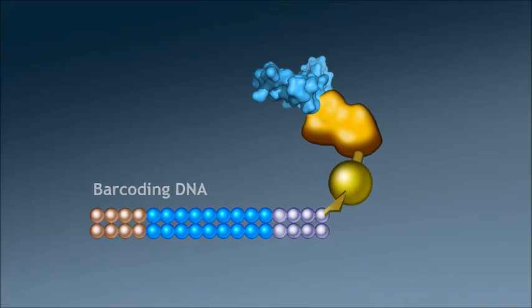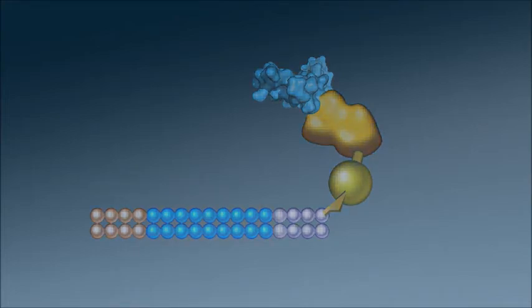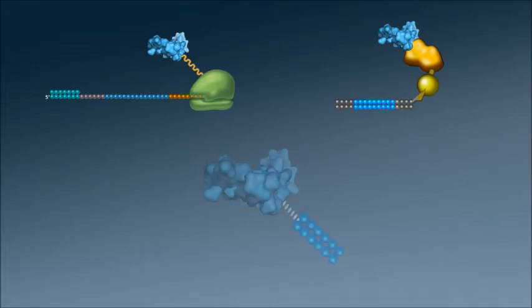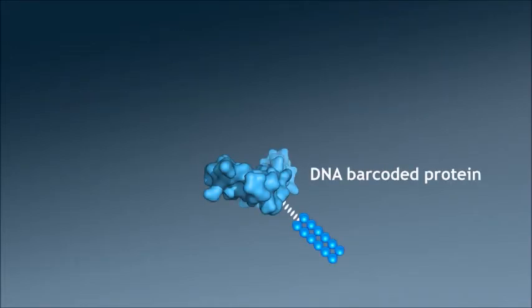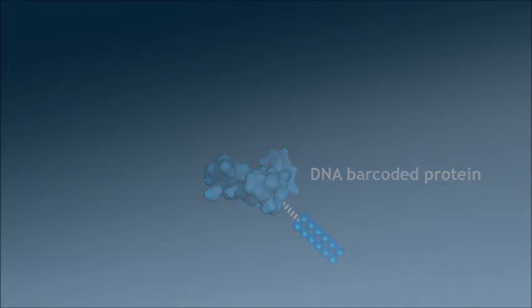Our lab is developing a technology to simultaneously select a large set of nanobodies targeting many proteins at an affordable cost. Using either the ribosome display or the nanobody-based method, a specific DNA barcode will be attached to a specific protein of interest, from here on shown in this simplified representation.